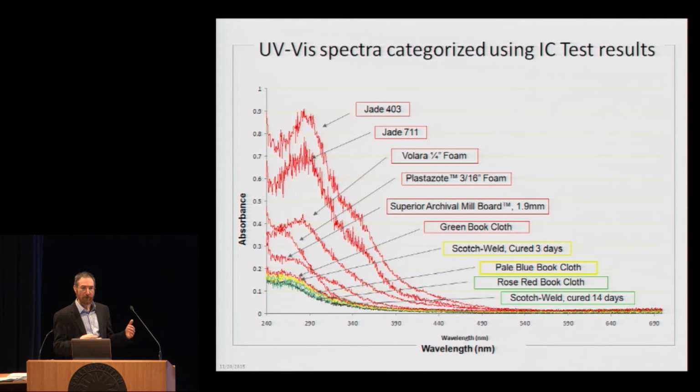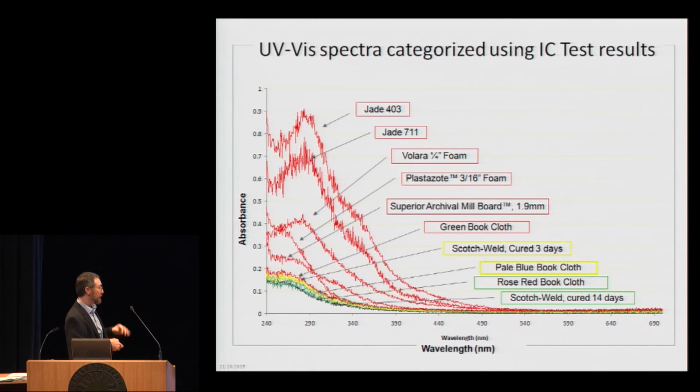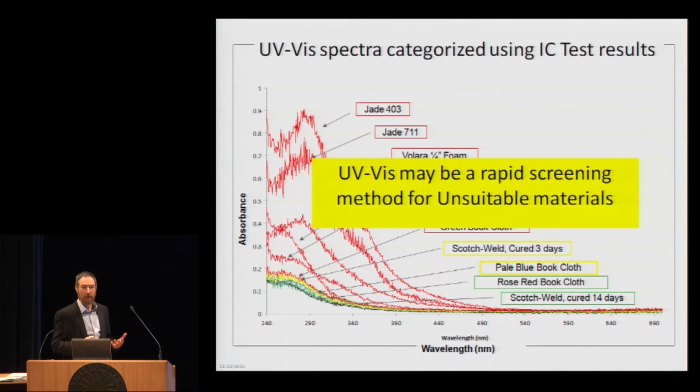Could I actually differentiate the temporary from permanent in this case? No. But can I differentiate a lot of these unsuitable ones? Probably, yes. And so this is a 1-minute test. It costs maybe an eighth of what an IC test costs. And especially if you don't count my time, it's an eighth. And that's just for the equipment, I guess. And so we could have said right off the bat, we don't need to run the IC test on this and probably don't need to run GCMS on it. Both are expensive techniques that require a lot of equipment and time. And so this could be, and I think it is, a nice screening method.